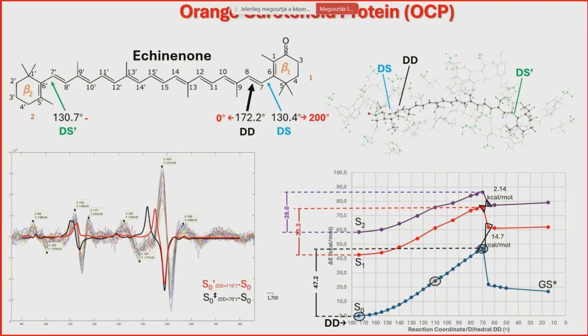So here is right at the transition state. We can see the red shift of the band, and here is that non-equilibrated ground state. We can see the slight blue shift. So it seems that these results are more or less matching both what the previous study showed with the semi-empirical potential, and they also match the experimental Raman spectra quite okay.